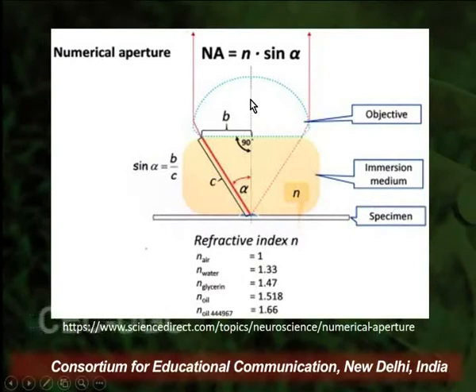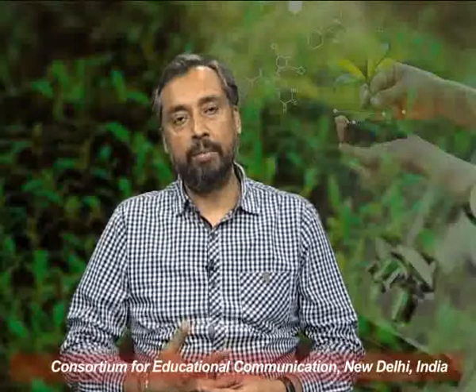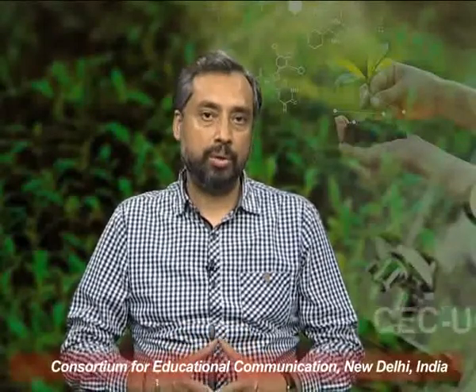Between the objective lens, here is your objective lens, and here is the plane of specimen, and between these the immersion media could be used. As we have already talked about, the higher the numerical aperture, the higher the resolution of any image would be. So let us try to understand what is a resolution.